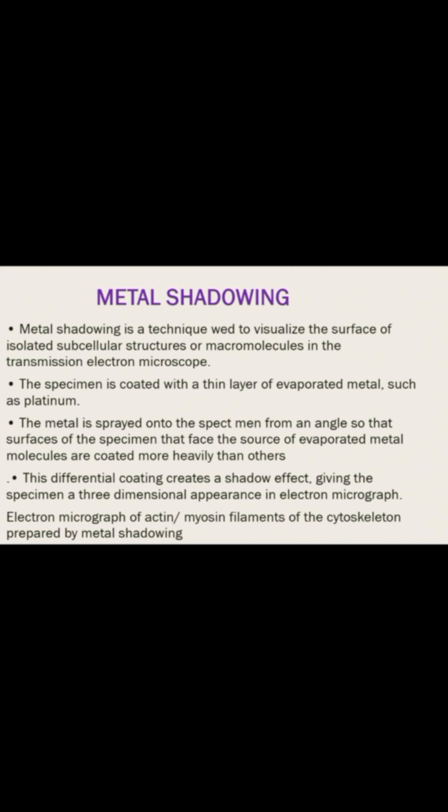Electron micrograph of actin or myosin filaments of the cytoskeleton prepared by metal shadowing.